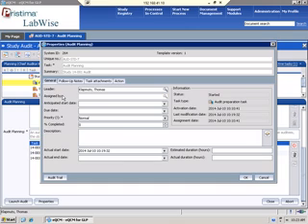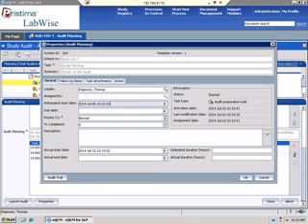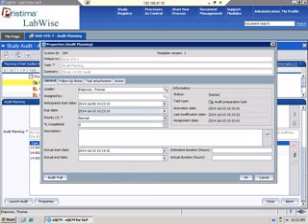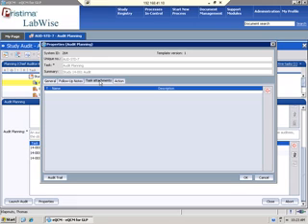You can just look at properties of my audit. Again, you can pick who's the assigned person. You can change the leader, the anticipated start date of the audit, the actual due date of the complete audit, priority, actual start date, description. You can put in some follow-up notes that will be maintained as part of the properties.